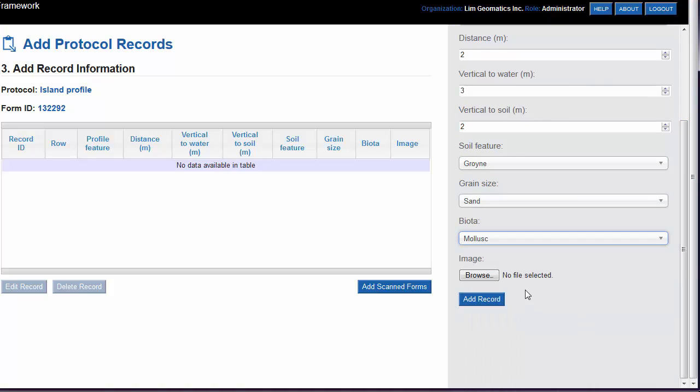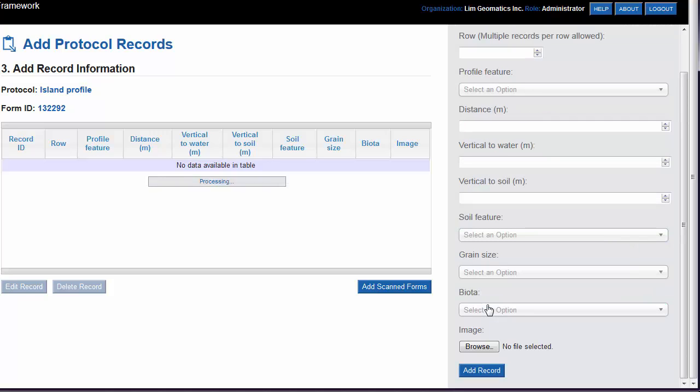When you're finished, you can click on the Add Record button. Note that it is not required to add an image. All other fields are required.